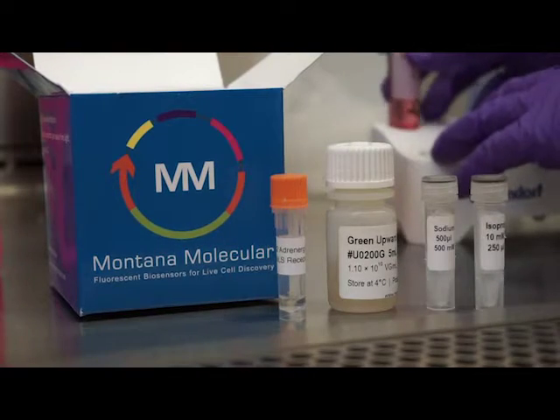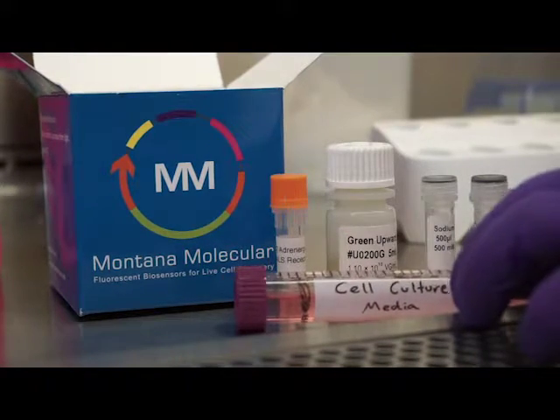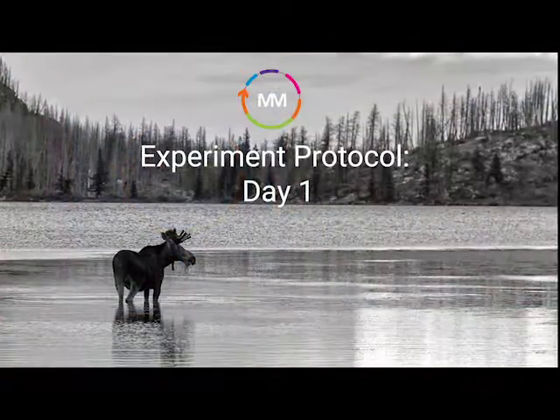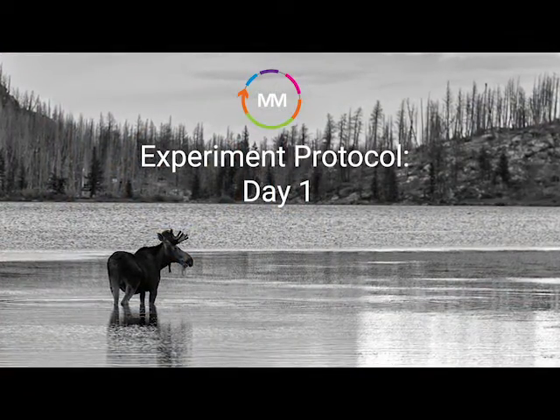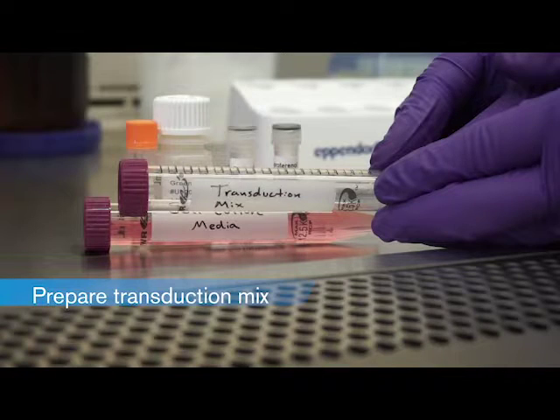To complete the transduction mix, you will also need cell culture media, which is not provided in the kit. On day one of the experiment, the transduction will be performed. The first step of the protocol is to prepare the transduction mix.